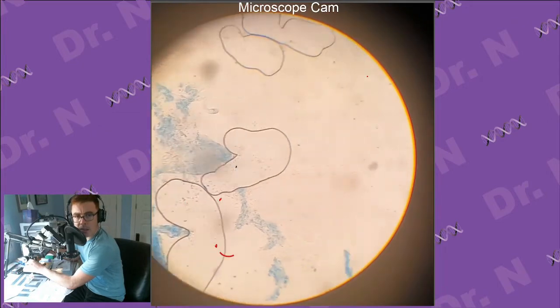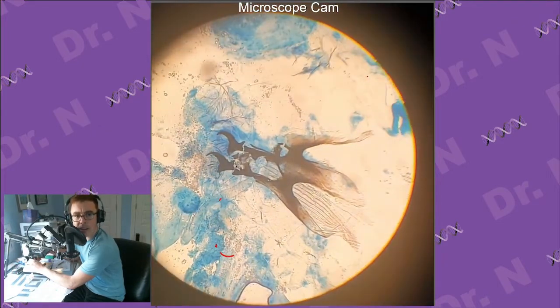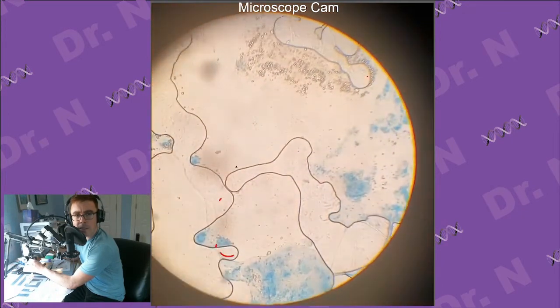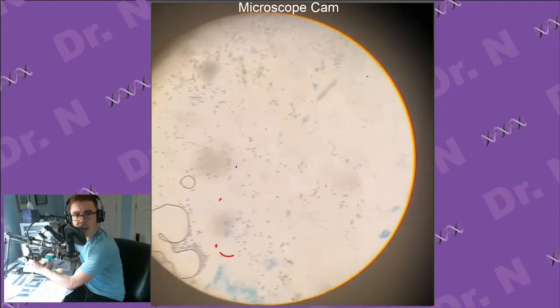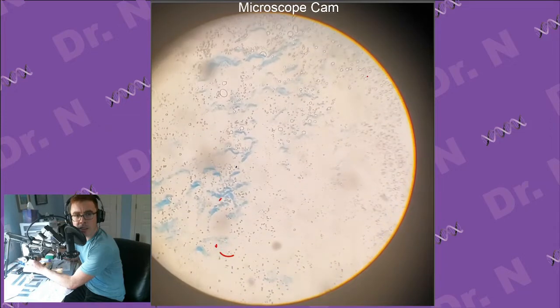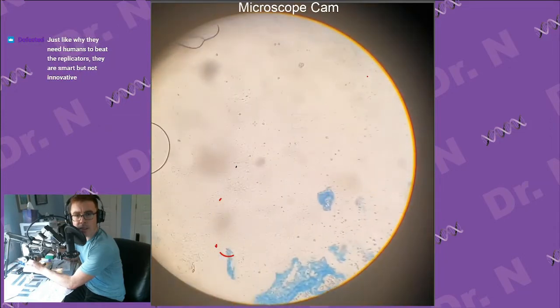All right, so I zoomed out a little bit just to take a better look at the material that we're working with. Oh wow, that's a really nice clear picture of those mouth hooks. Yeah, I may have destroyed those organs that I was looking for.